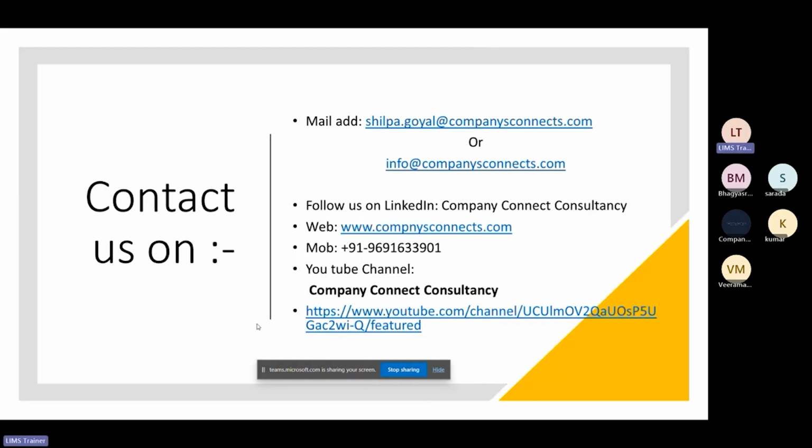Now tell me if you have any questions on your mind about this course, about LIMS, about anything. Yes, please. Actually, I want to know, in this course, in the development stage you are writing the configuration and all. What are you covering, all the coding or only code testing?